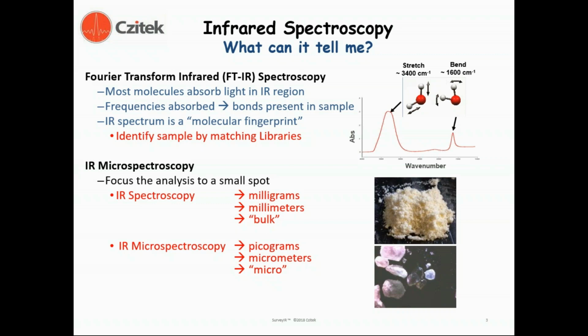At these specific vibrational frequencies where the infrared radiation is in resonance, we will see an increased vibrational amplitude and the absorption, the transfer of energy from the incident field to the molecule. So these areas where peaks are observed are very characteristic of a molecule of interest, very highly specific, and extremely useful in characterizing materials.